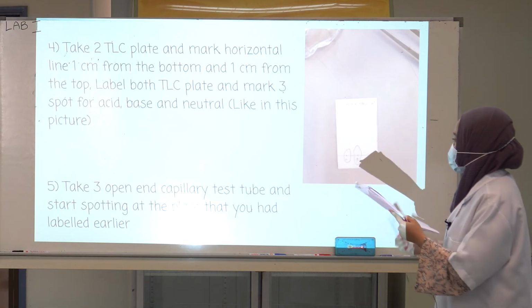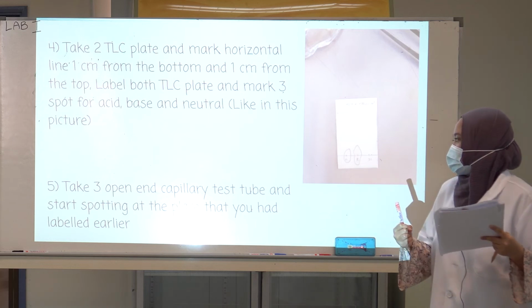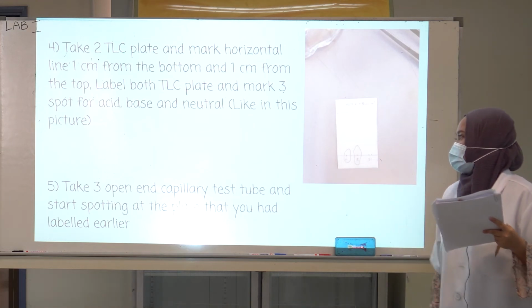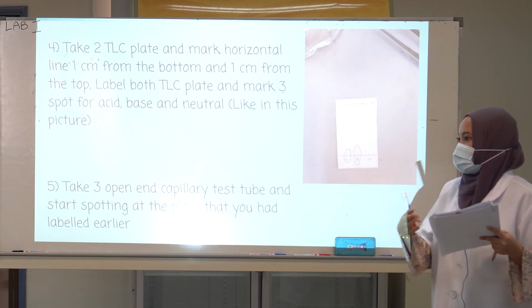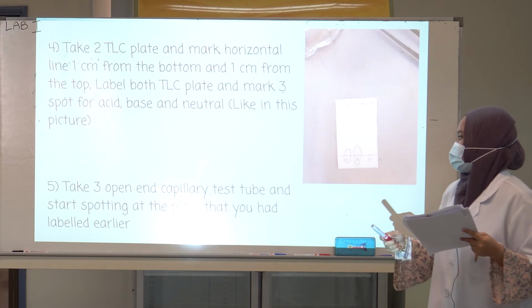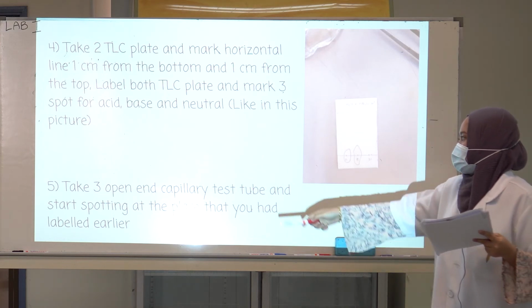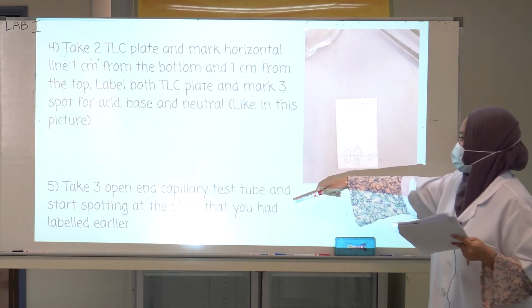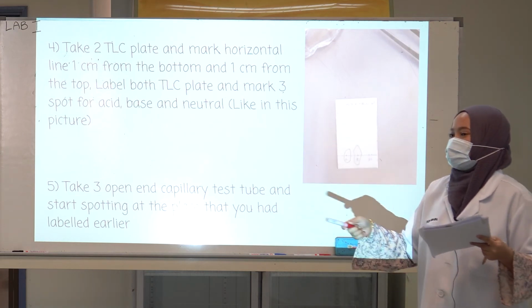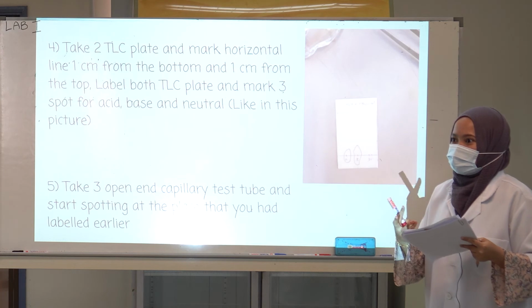Then we have to prepare 3 open end capillary tubes and start spotting at the places that you had labeled earlier. Before this we prepared 3 solutions, right?